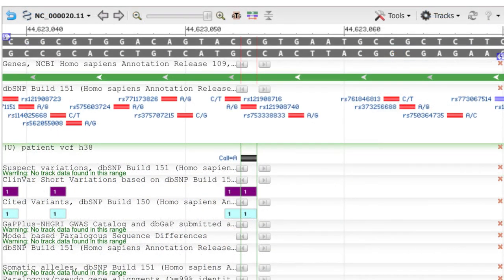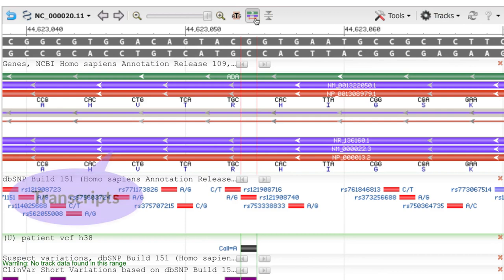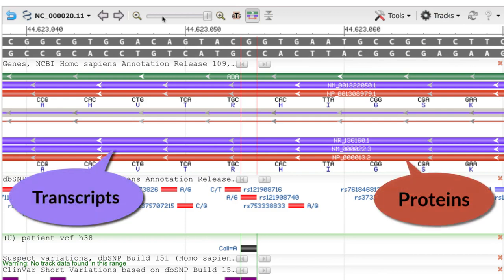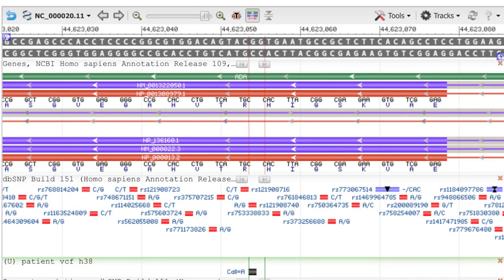We'll display the transcripts and proteins in this region by clicking on this handy Show All button for the gene track. I'll zoom out a bit, and now we see the beginning of the exon containing our called A allele.